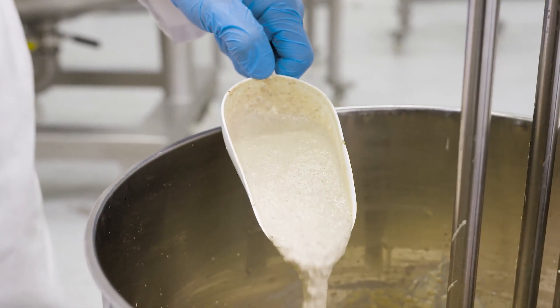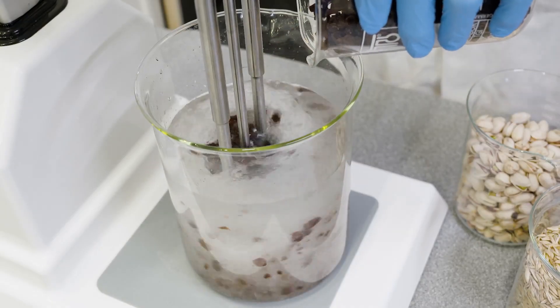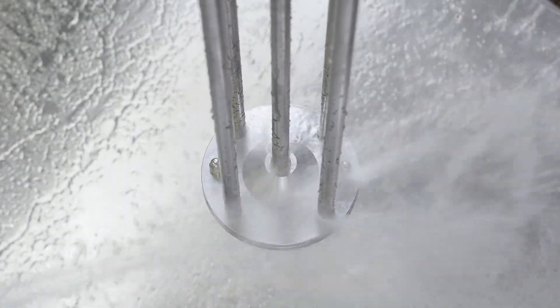The consistent results obtained with the Silverson mixer make the process easy to validate. Silverson mixers can also handle a wide range of viscosities and materials of different sizes and shapes. They are also easier to clean than traditional milling and grinding equipment.